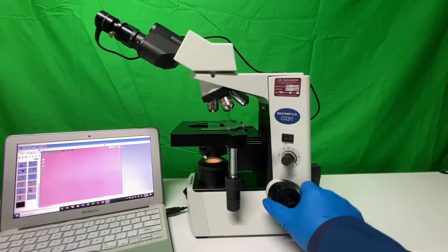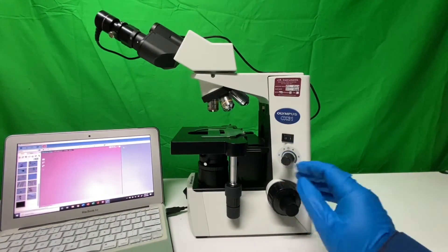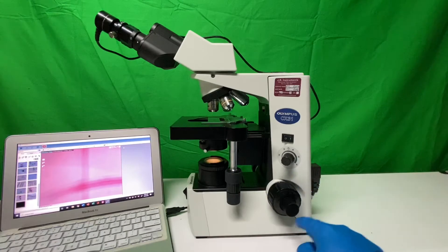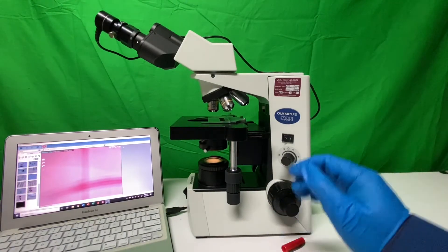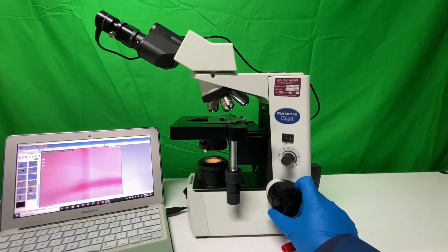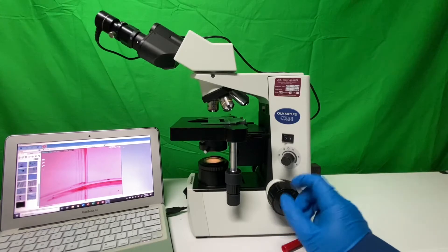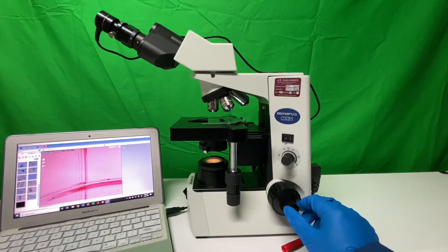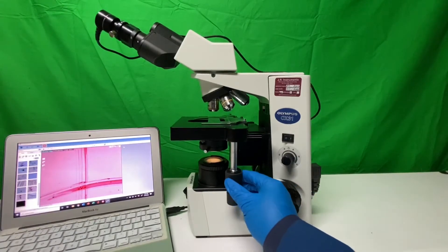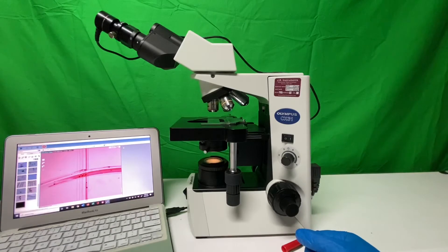Ideally, you'll load up your slide under the stage clip and while it's all the way to the bottom, raise it all the way up — notice the direction I'm turning the coarse knob. Once it's all the way up, the image will start to appear, and all you want to do is a very tiny one-eighth of a turn. Most of the image pops up at that point. Then use the fine knob adjuster to get the best possible focused image. There's our little cross drawn with the Sharpie.